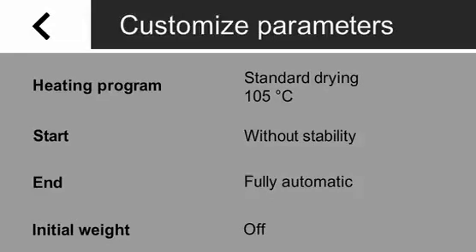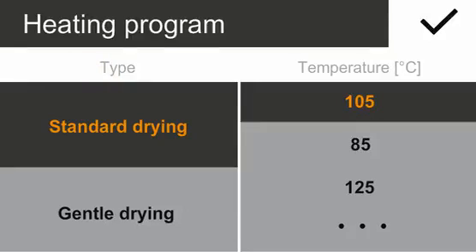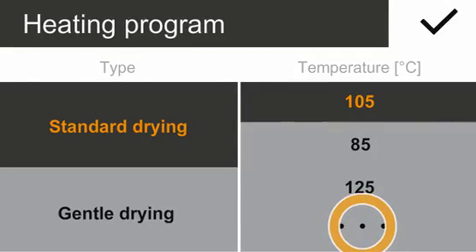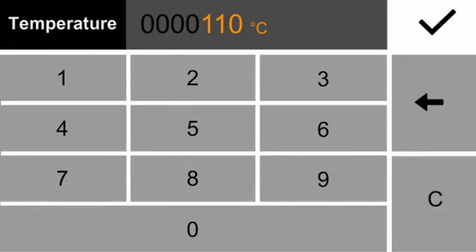In this view, all adjustable parameters are listed. Please tap on Heating Program to adjust the temperature. Select Standard Drying and then choose Manual Input, which is represented by three points. Please enter 110 as the drying temperature and confirm your input.